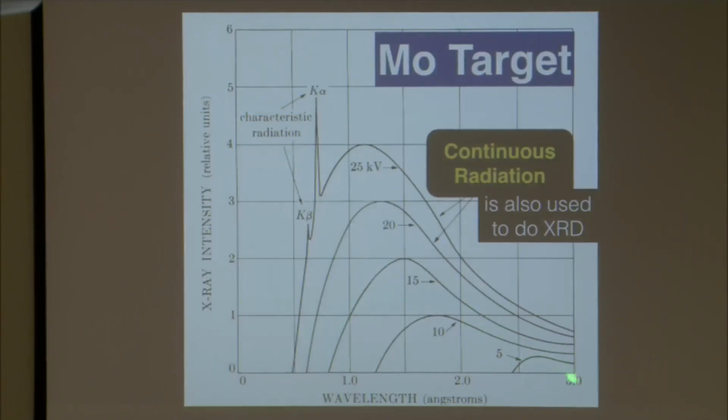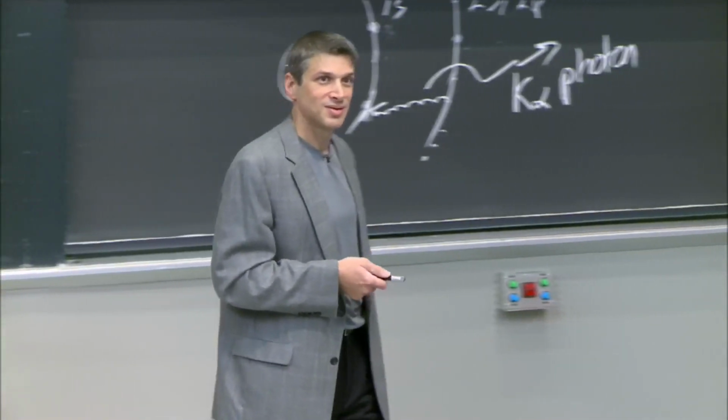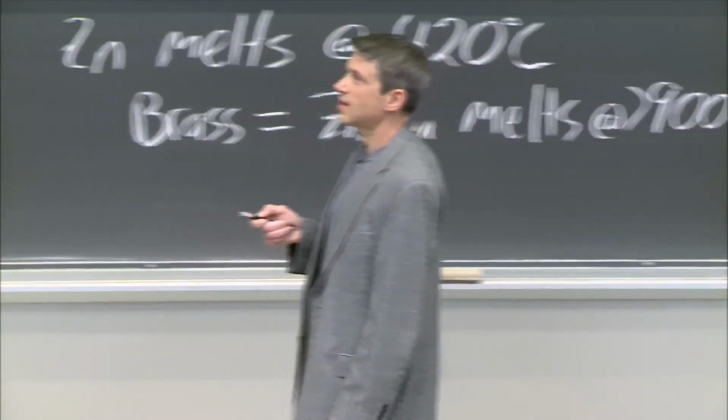What we need to know is that as you increase the power of those incident electrons, you're going to get more and more intensity of X-rays, and this goes down. This minimum wavelength, or maximum energy of the continuous spectrum, the maximum energy goes up, because the maximum energy you can get in the continuous spectrum is equal to the incident electron itself. So it's set, right? Remember the Duane-Hunt limit? We talked about that already, how to get that value.